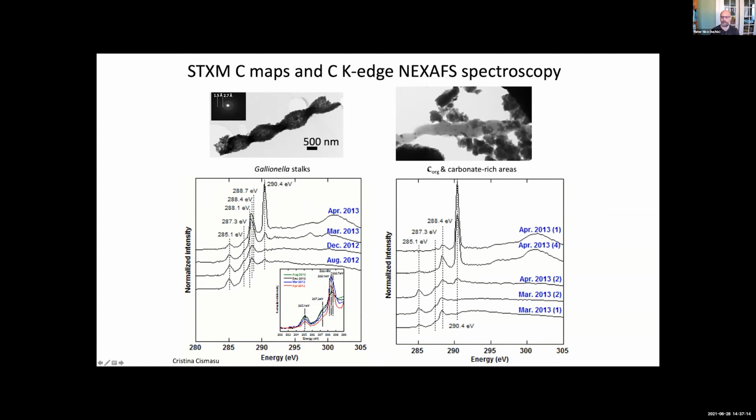Meanwhile, we can look at these other types of carbon that show up over time, and we can see that we develop actual iron 2 carbonate precipitates, where here's the carbonate spectrum in the NEXAFS with almost no organic component. And we see that our organic matter globules, very fancily termed, as I said, associated with the iron 3, are still there, even in March and April. And they are the least oxidized and look most like the original carbon material. The organic matter globules seem to be oxidizing more slowly or not at all compared to the rest of the carbon.